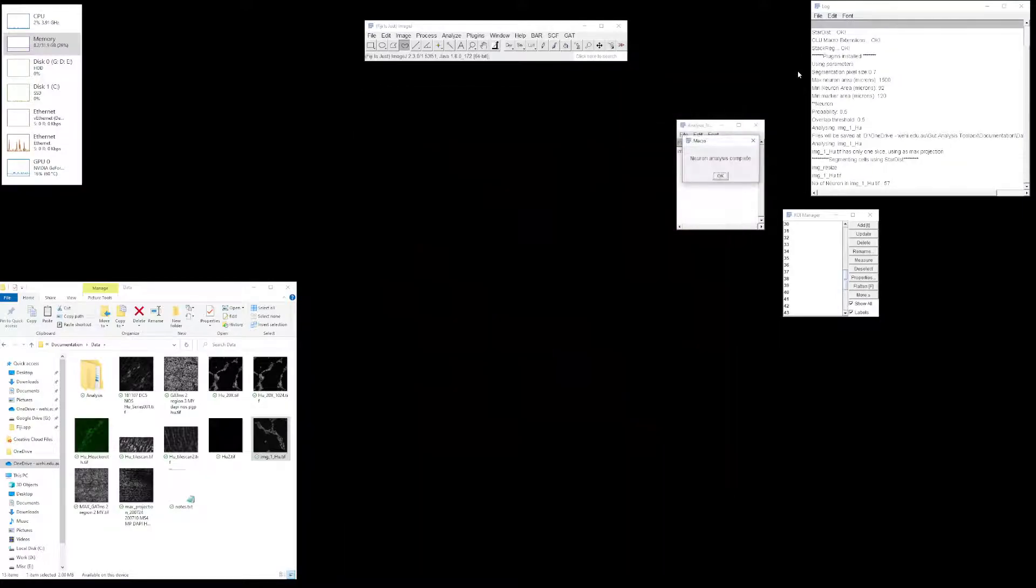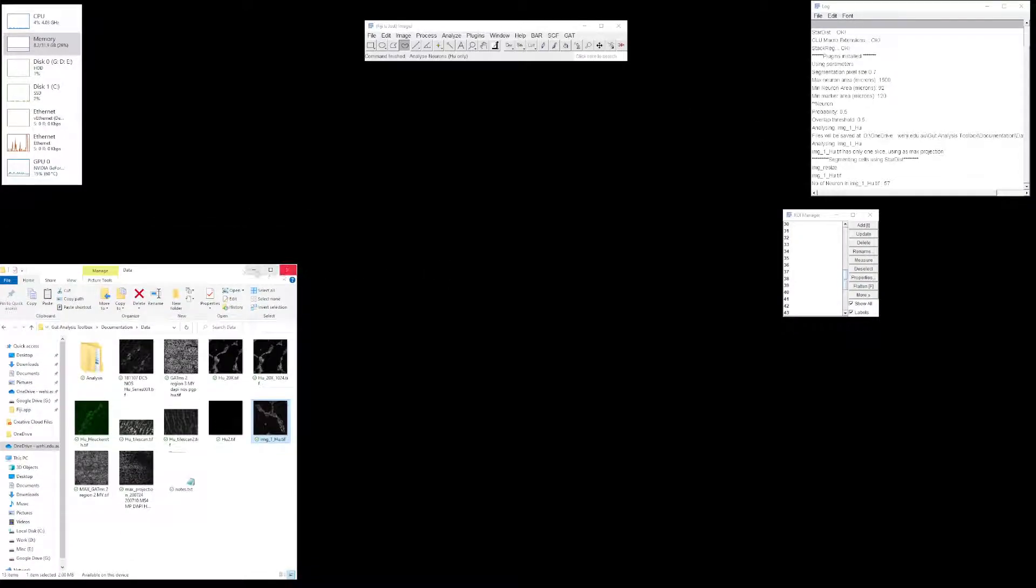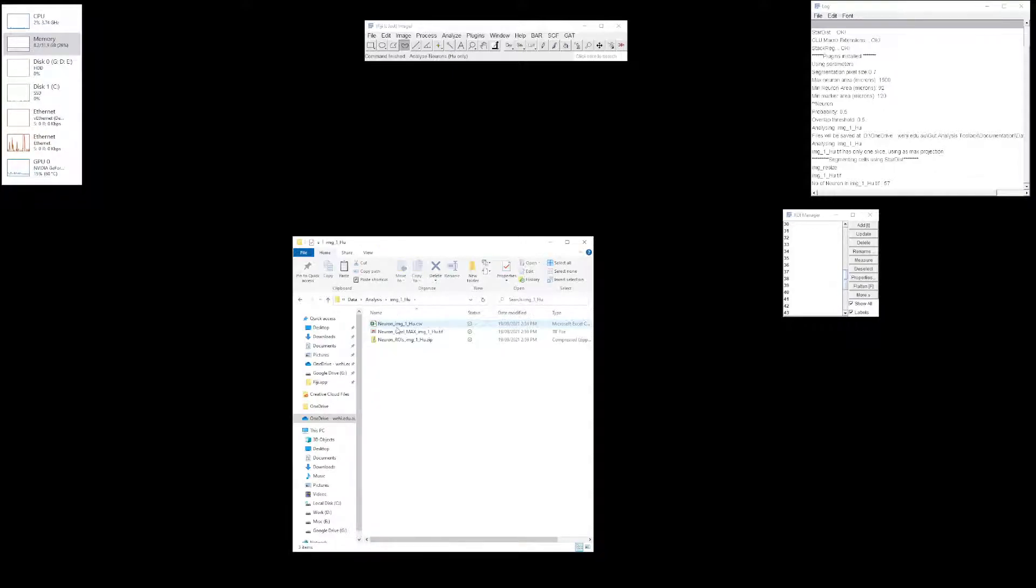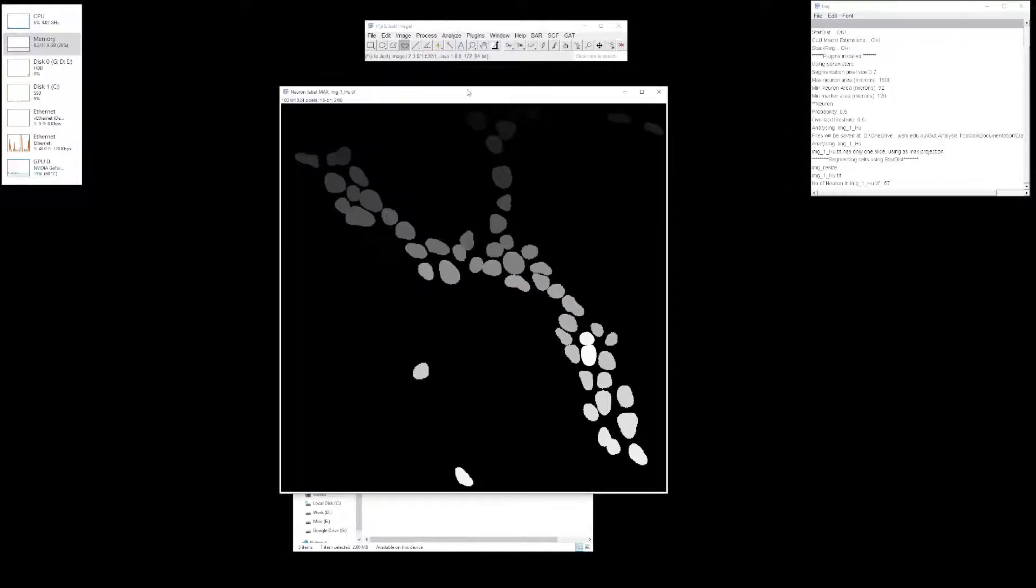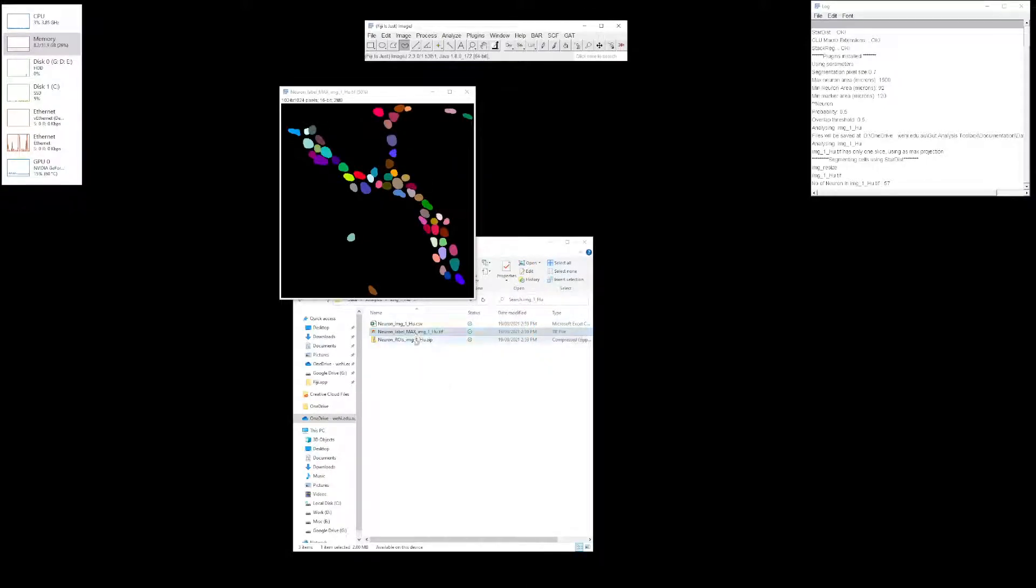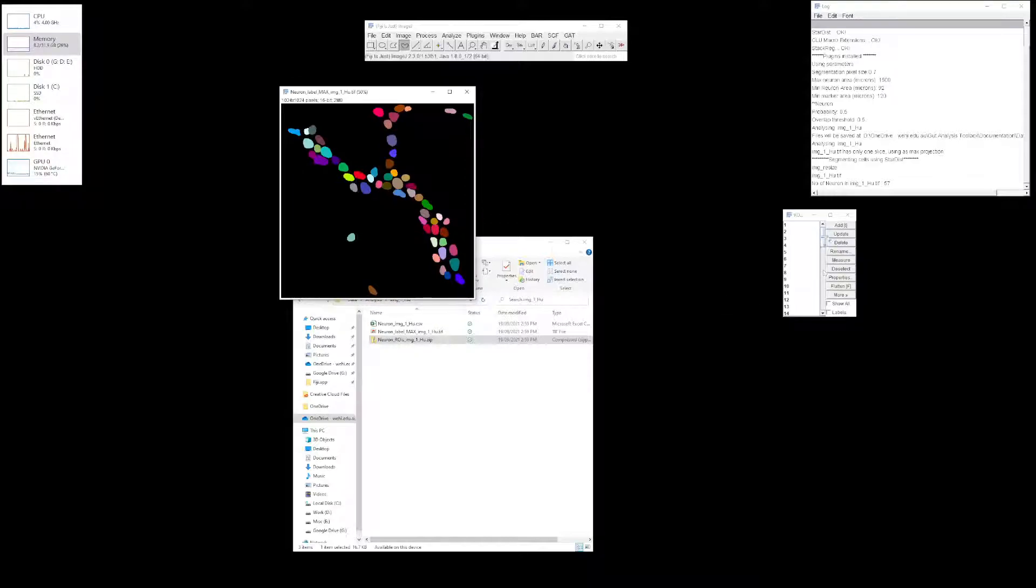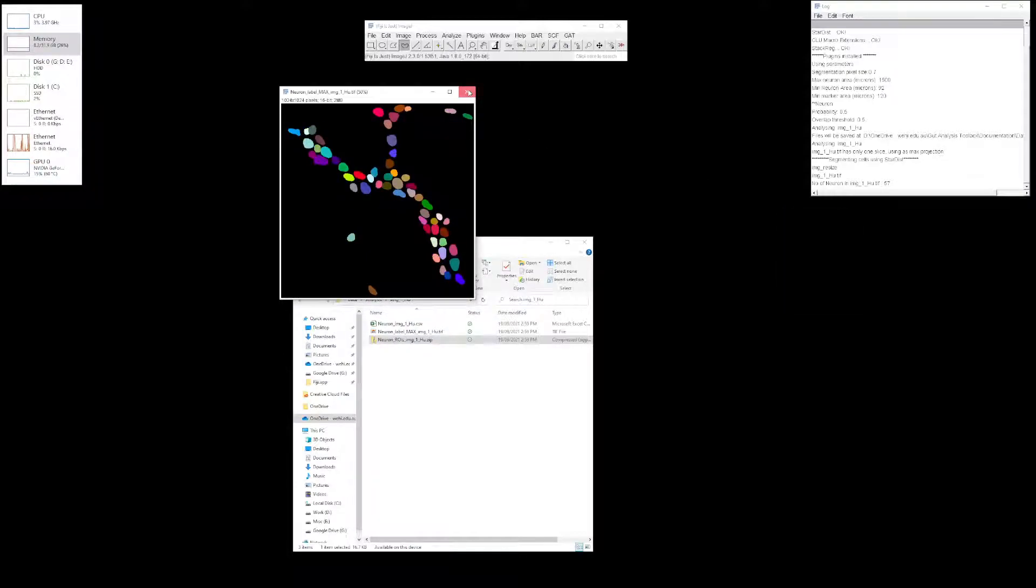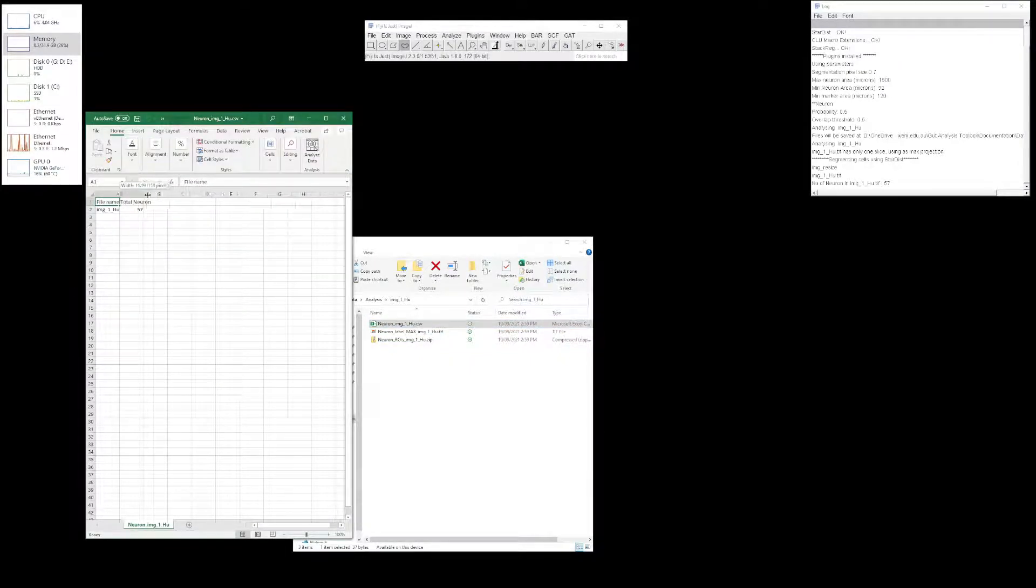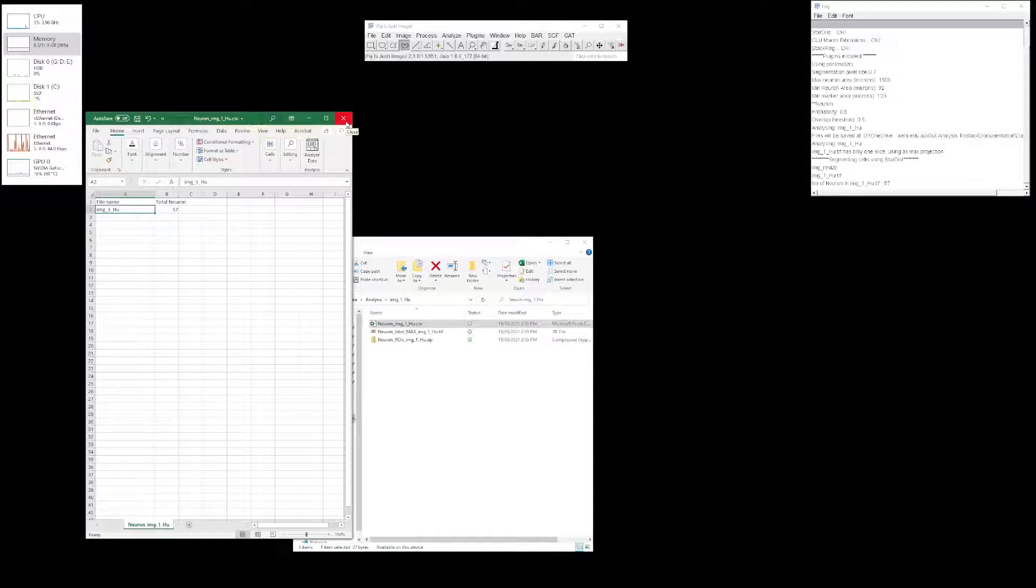Click OK and you get a dialog window saying the analysis is complete. The file name is here and the total number is 57. If you look in that folder where the images are, a folder was created called analysis with a subfolder named after the image. The first file is the label map where each cell is labeled in an individual color. Then you have the ROI manager which has been renamed based on the number of neurons. If all you want is the information pertaining to the numbers, there's a CSV file which can open in Excel containing the file name and number of cells.